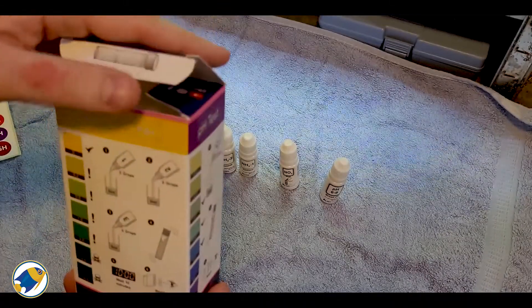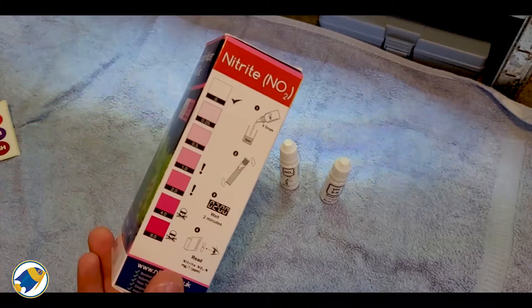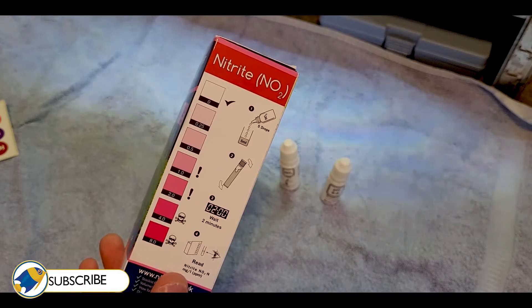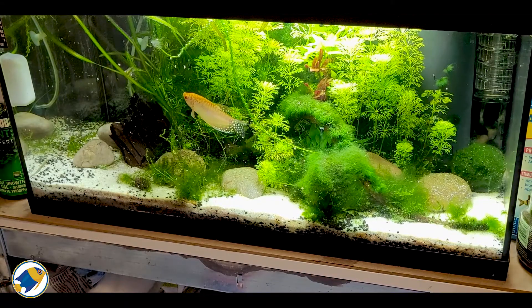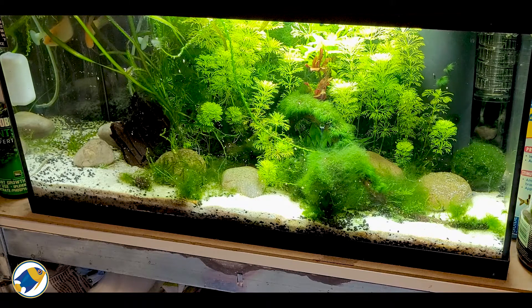All the charts are on the box, which is really cool. It's recommended in the manual that you use natural light to measure the solution, but I found you can get on relatively well with whatever light you've got around. To give more precise results, natural light is always going to be better. For the purposes of this video, this is the aquarium we're going to test — my planted aquarium. I did a water change at the weekend, so this is only a couple of days afterwards, so it should be pretty decent in terms of results.